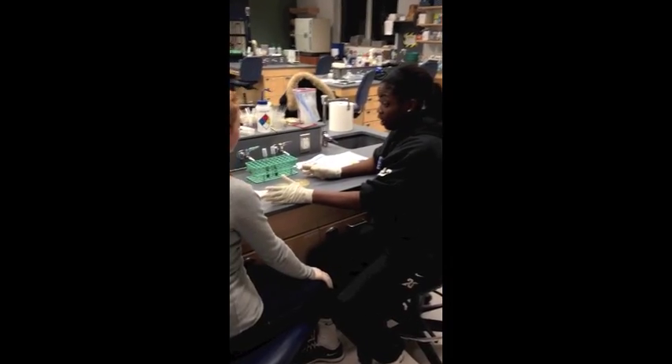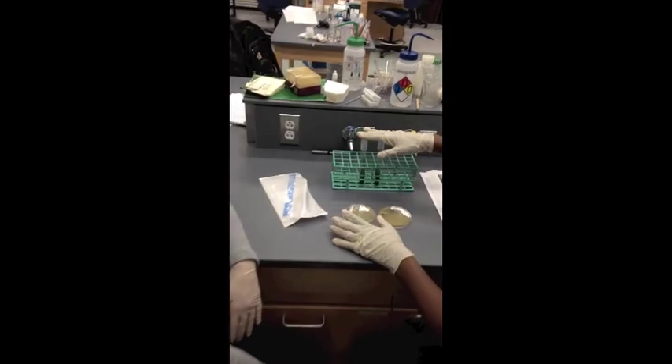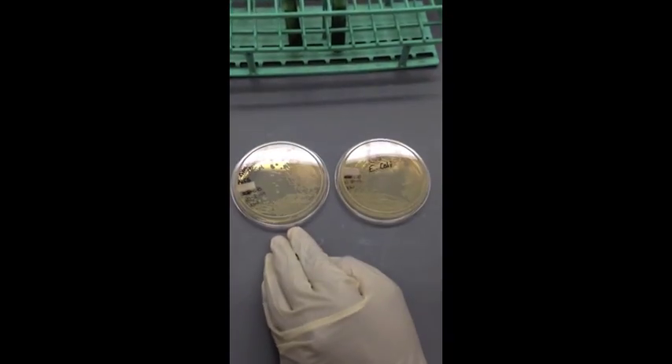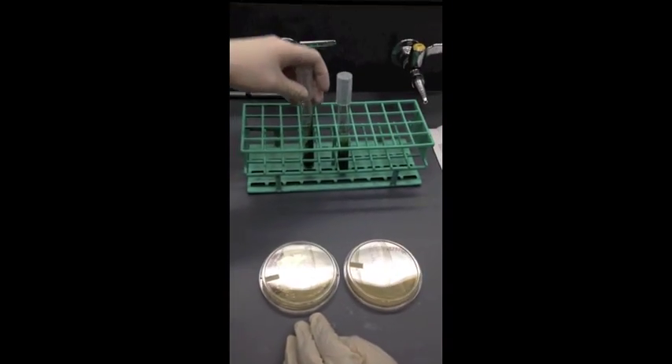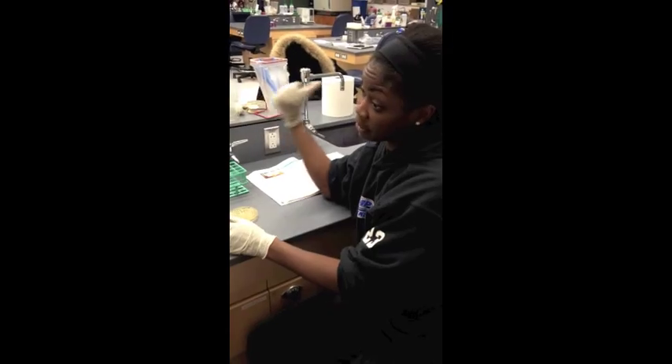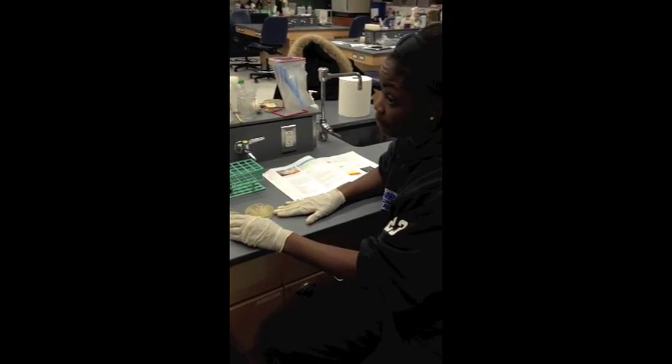I gathered all our materials — we have our sterile loops, our two uninoculated tubes, and our bacterial streak plates of E. coli and Enterobacter. And Marie, why did you label everything? I did that for identification purposes because when we put things in the incubator, we don't want them to get mixed up with anyone else in the lab.